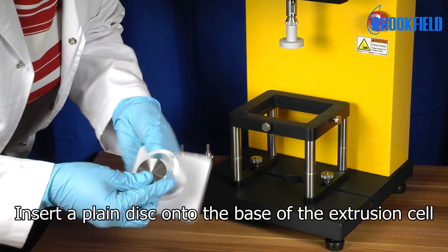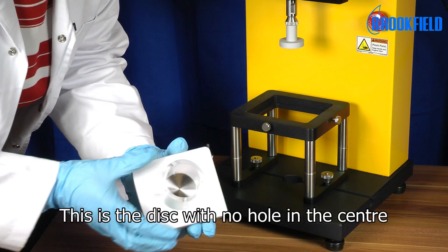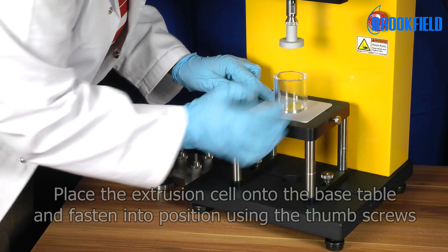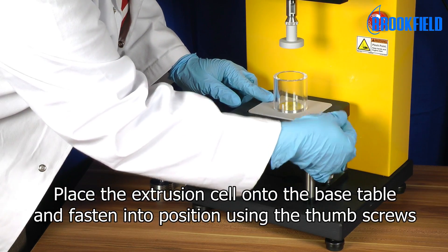Insert a plain disc onto the base of the extrusion cell. This is the disc with no hole in the center. Place the extrusion cell onto the base table and fasten into position using the thumb screws.